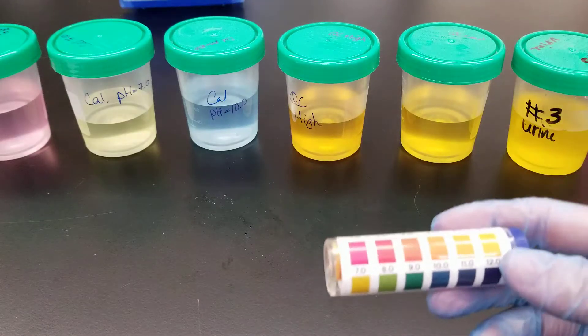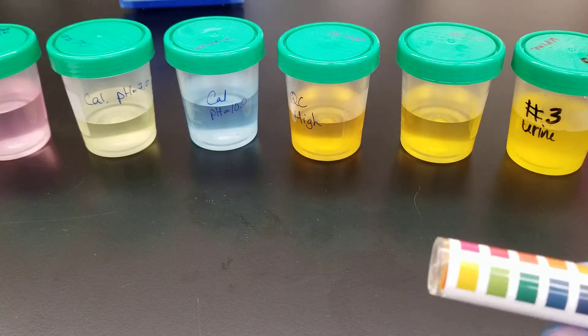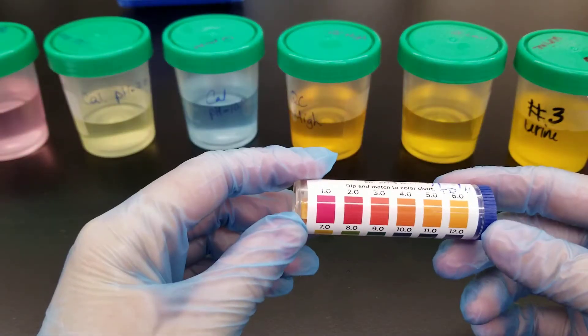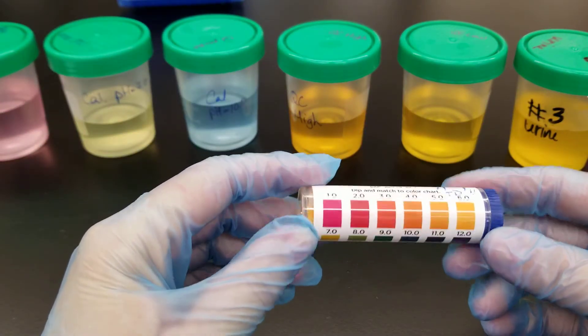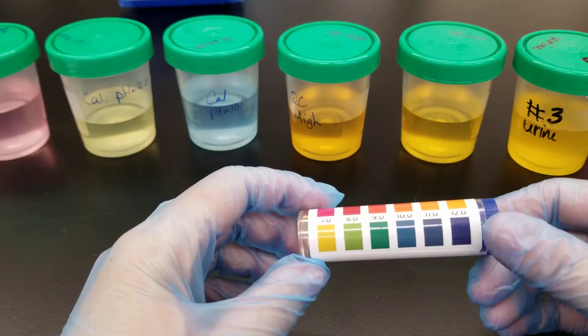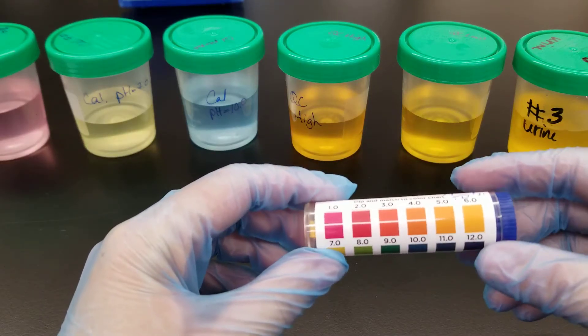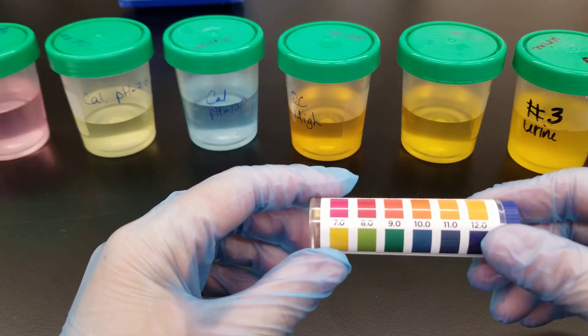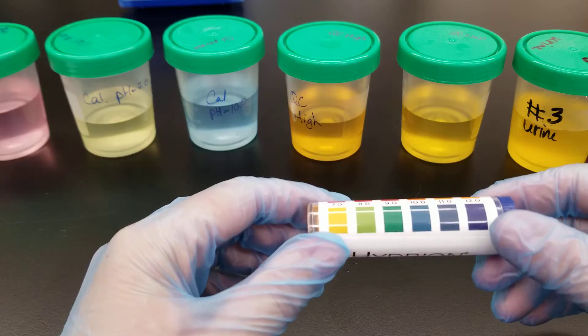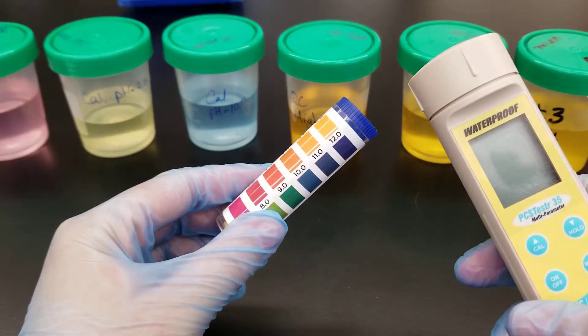Hello everyone. Today we're going to be measuring pH using pH paper. As you can see, this is a manual and biased type of analysis, which means that it all depends on the user's interpretation of color, which is not as accurate as the pH meter that we did in the other video.